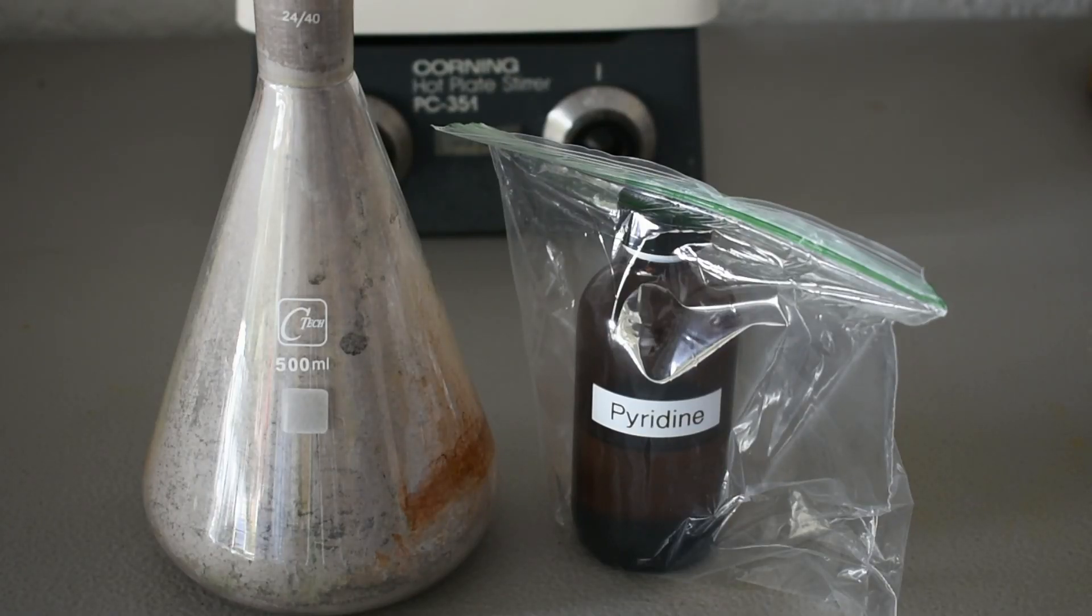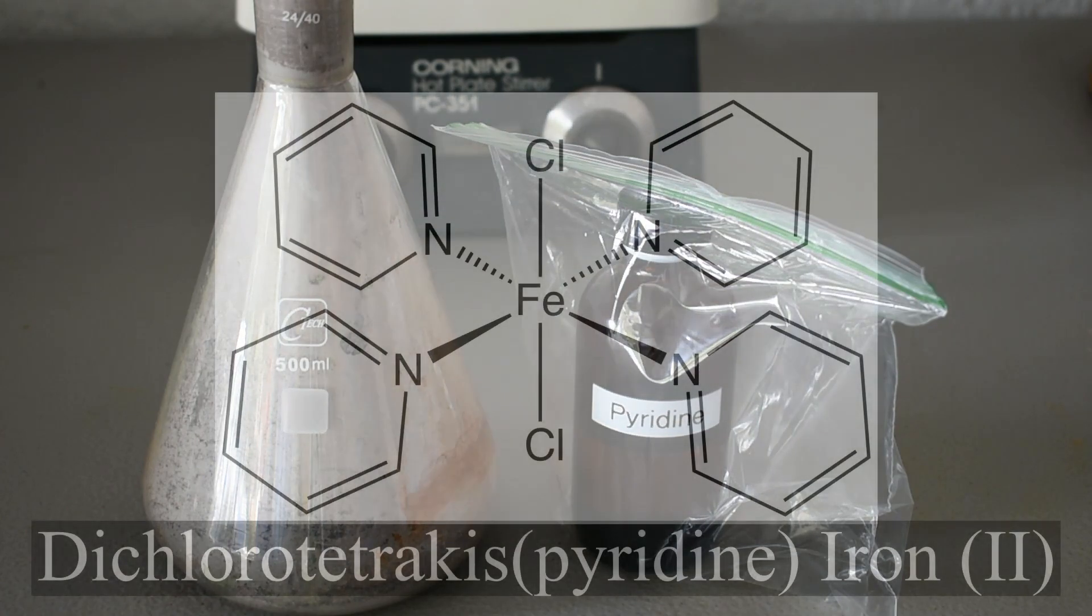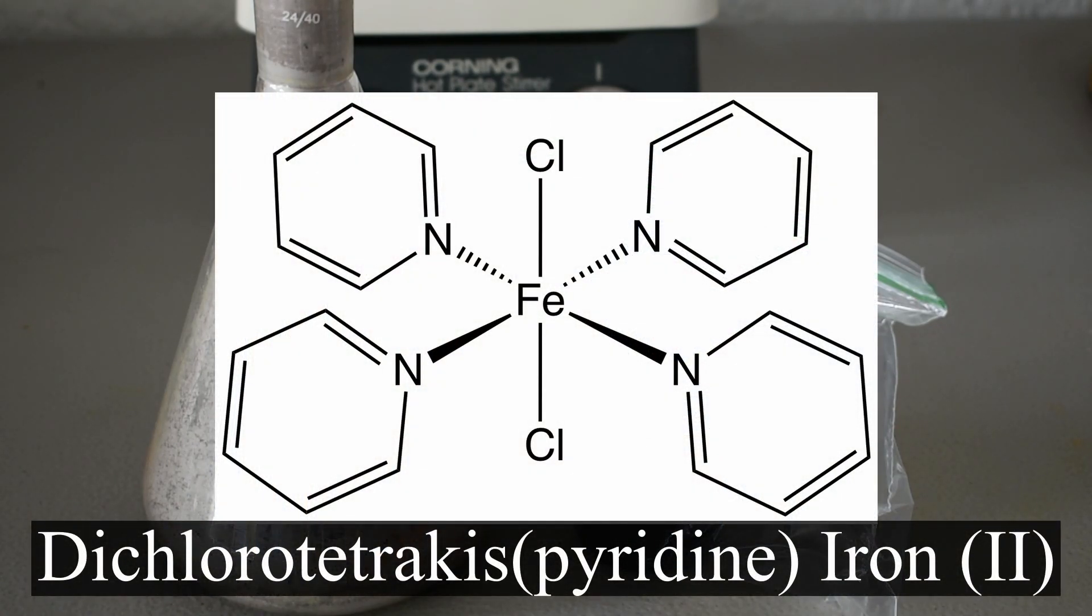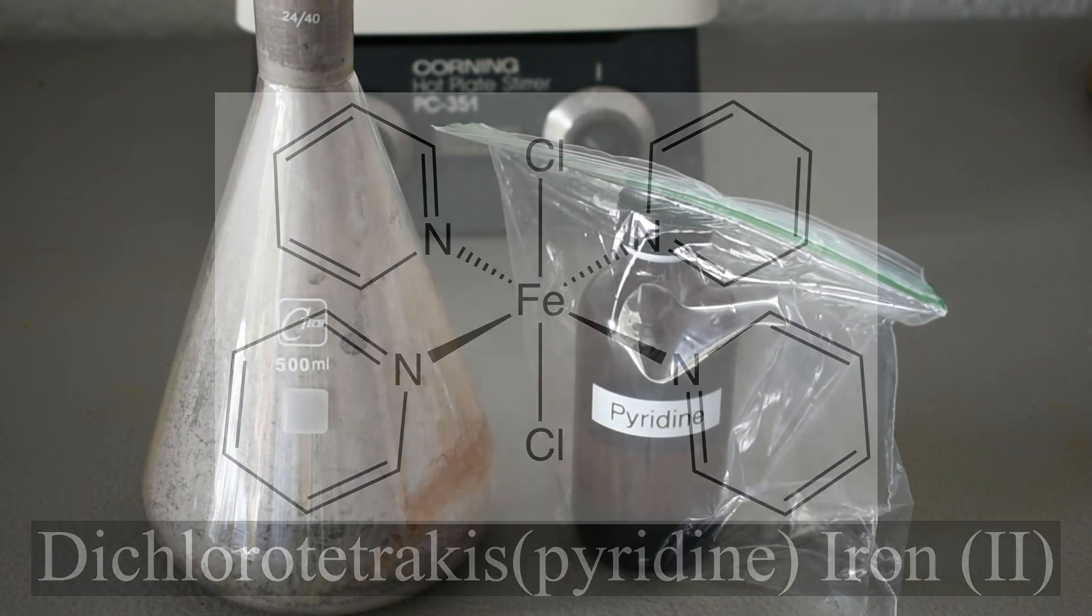Hello everyone, welcome to a new video. Today we're going to be making a mouthful of a compound called Dichlorotetrakis pyridine iron 2, which is basically just iron 2 chloride with 4 pyridine ligands attached to the iron.